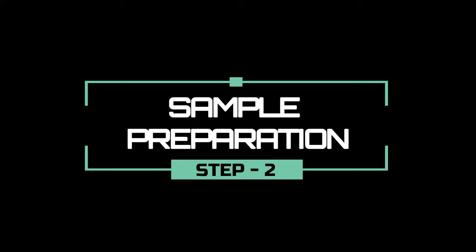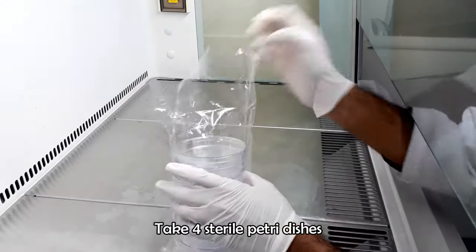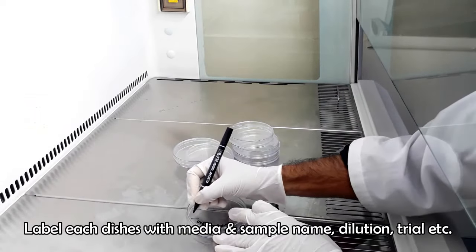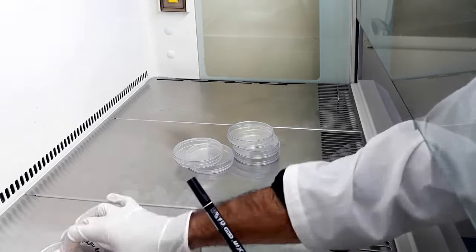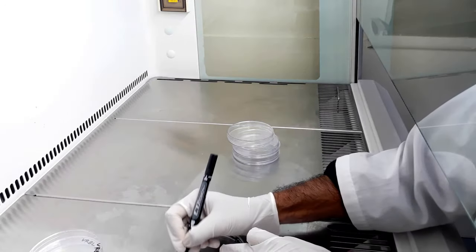Now we will prepare our sample. Start working on a clean workstation. First, label sterile petri dishes with media, sample, dilution, trial, etc. We will test each dilution in duplicate, which we call trial 1 and trial 2.